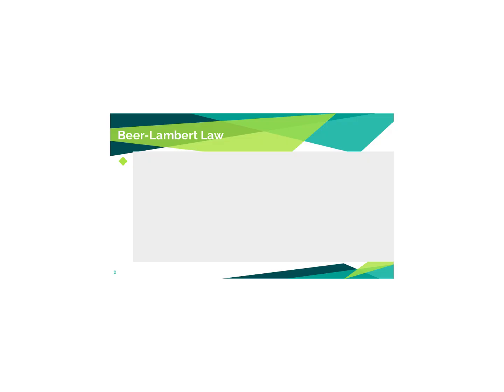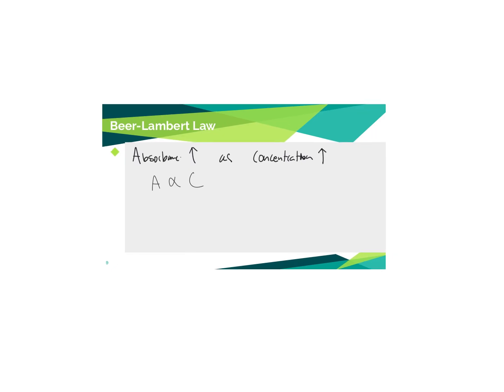Now, the reason why we really care about this in the context of solutions is because I said earlier that absorbance goes up as concentration goes up. In other words, absorbance A is proportional to concentration. And so if we know something about the concentration of a solution, we can infer how much light it's going to absorb, or if we know how much light a solution absorbs, we might be able to figure out its concentration. And that's where the Beer Lambert Law comes in.